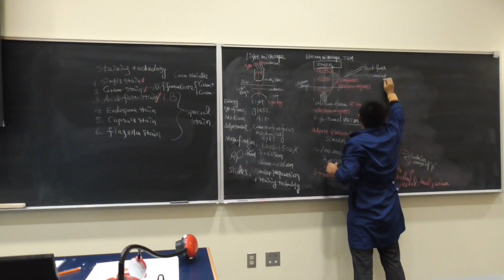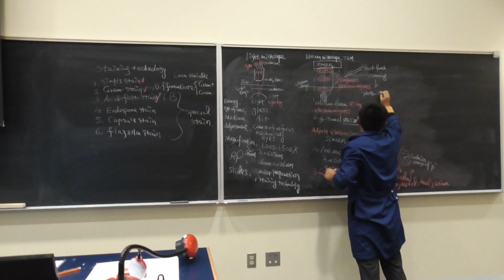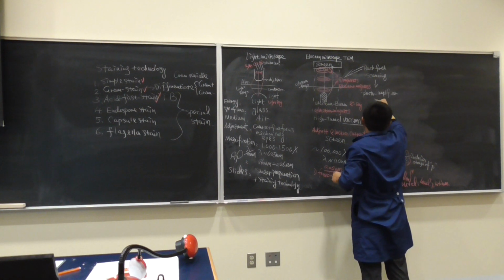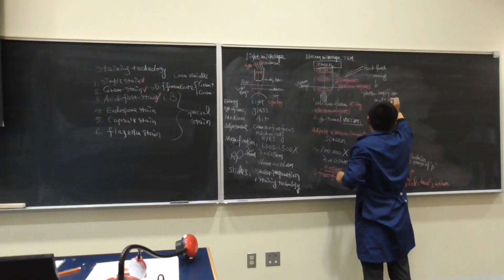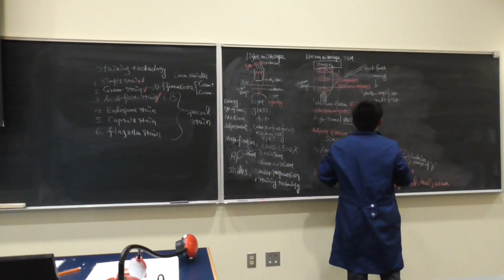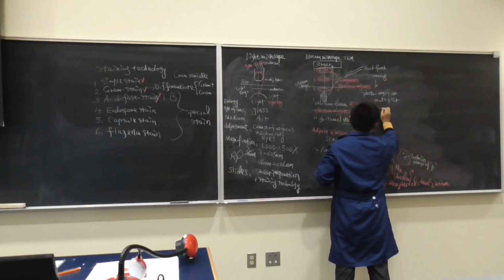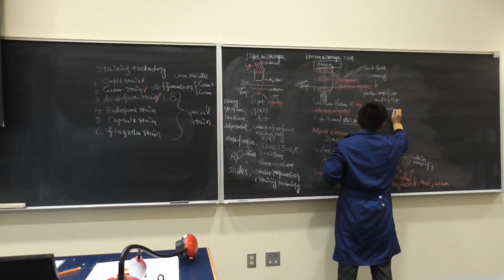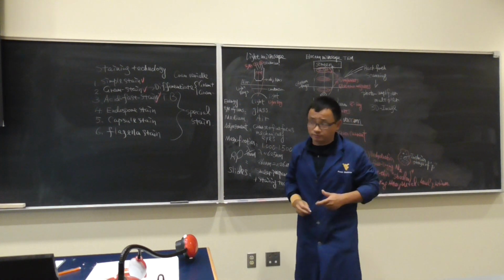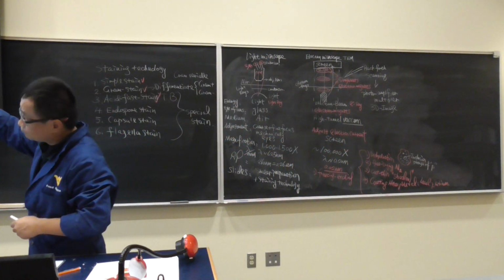And the signal will be transferred to a photo amplifier, sometimes we call it a multiplier. And then on the screen, you will see those 3D images. And it's very similar to the laser confocal microscope. We want to see the surface. This is what it looks like.